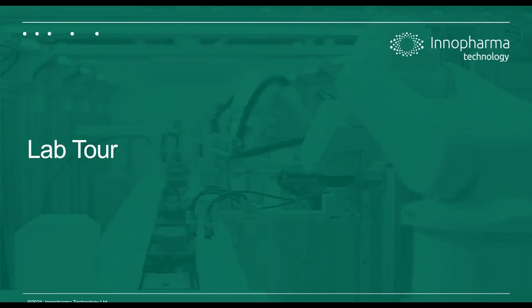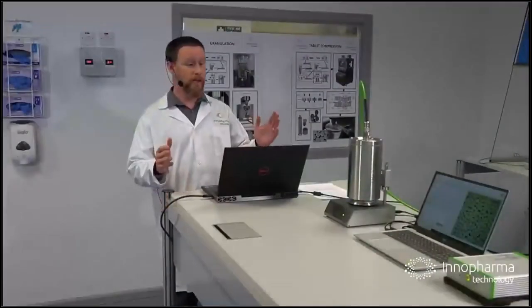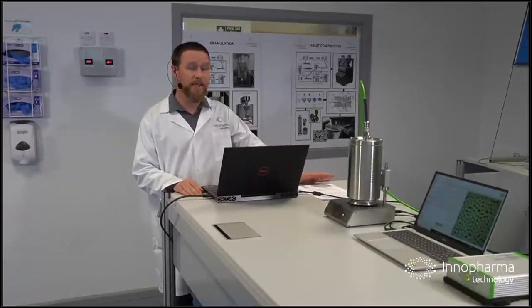Next, we're just going to switch over to a little bit of a lab tour here, showing some of this hardware. So I know Julie mentioned at the beginning, but welcome to our process lab here in Dublin, Ireland. This is where we test all our analytical equipment. We also do a lot of solid oral dose processing here as well.